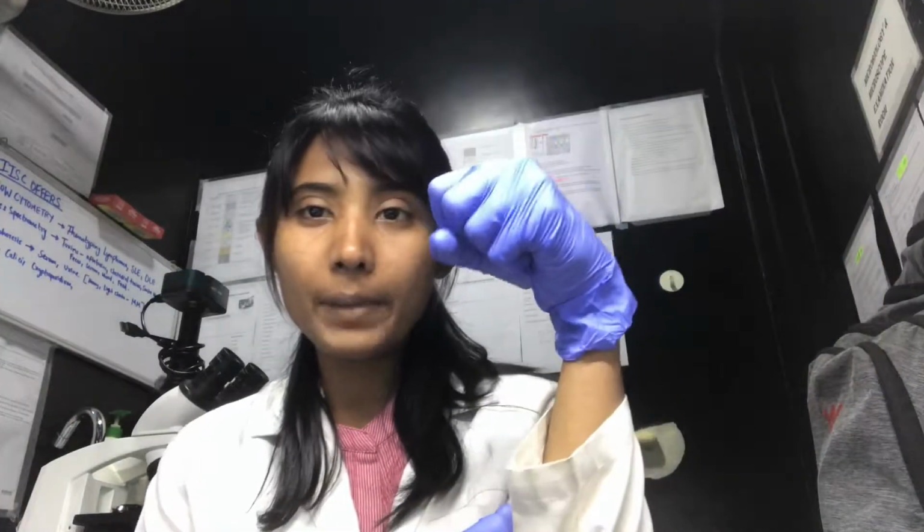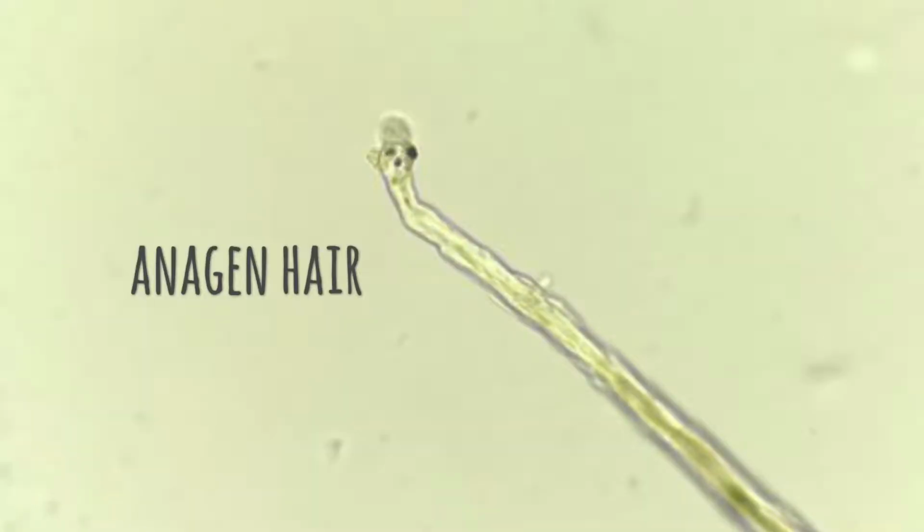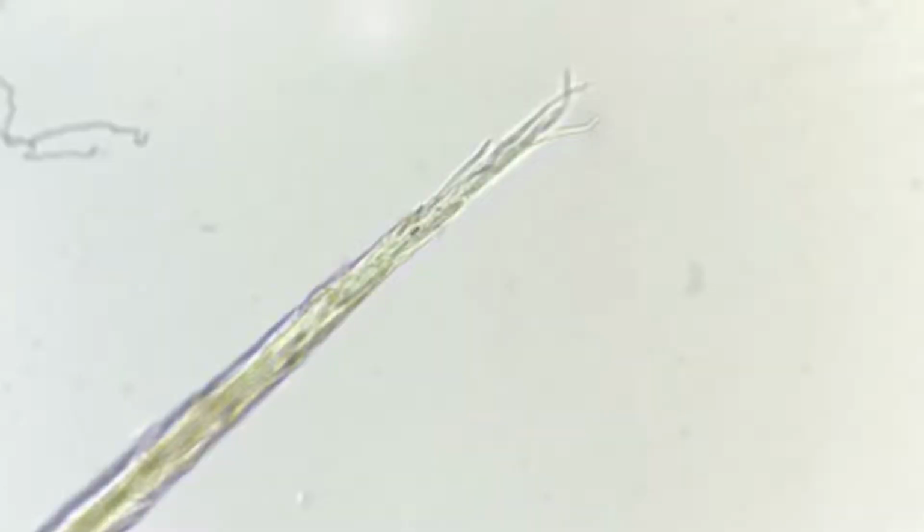Under microscopy, you are going to see only two types of hairs. One is anagen and the other is telogen hair. Anagen hairs are the ones whose hair roots are rounded or bent like this. The borders are often smooth and they are pigmented. Telogen hairs are lancet shaped and they lack pigment. The base of the hair will appear like a brush or radish. If you find a hair with broken tips, it is often associated with pruritus.